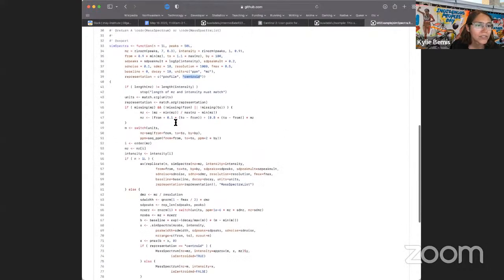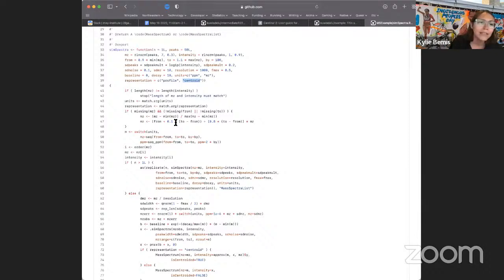And it basically works just by creating Gaussian peaks, overlaying noise, simulating some mass shift and other things like this. But yes, it's available both here. You can copy paste it if you credit me. It's also available in the Cardinal package on Bioconductor as simulateSpectrum from there.